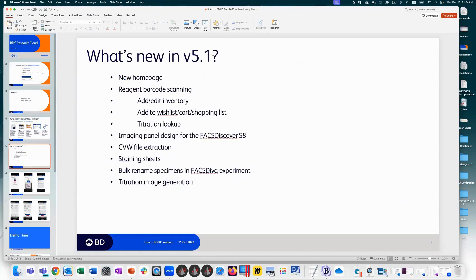So what is new in 5.1? We have a new homepage and reagent barcode scanning capabilities. Using your phone, tablet, or anything with a camera, you can scan BD reagents that have a 2D code. This can be used to track inventory — scan items as an order comes in. Once in inventory, you can add titration information. You can scan a vial to quickly look up the titer, or scan to add a reagent to your wishlist for reordering.